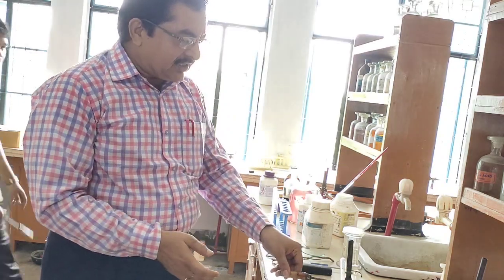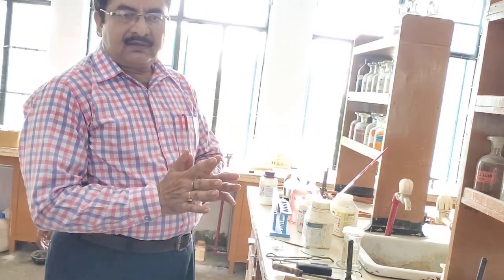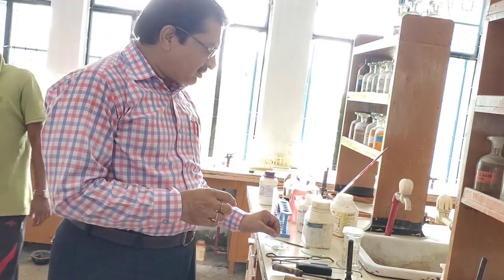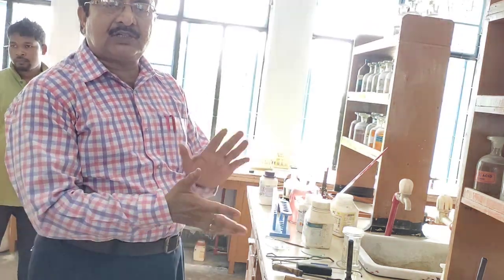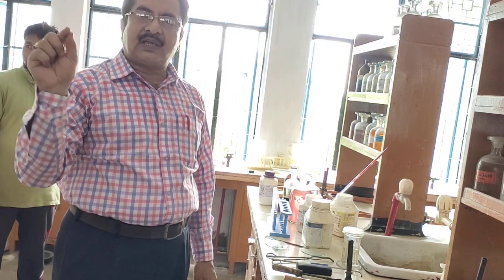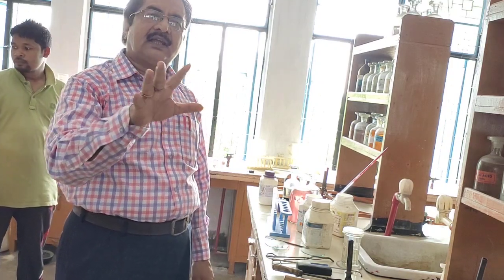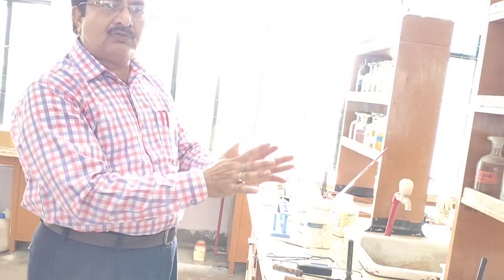So for the same test, how do you write? A well washed dry test tube is taken. In that, a small amount of salt is taken. This is your experiment. In observation you will write that a cracking sound with brown fumes is coming. And in inference you will write that a salt of nitrate may be present, salt of lead may be. This information you got from the action of heat.